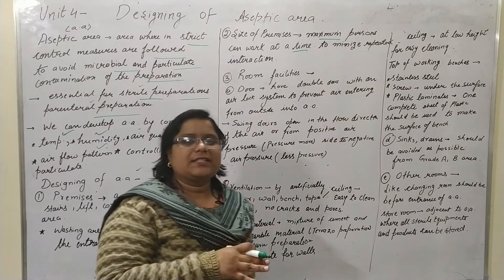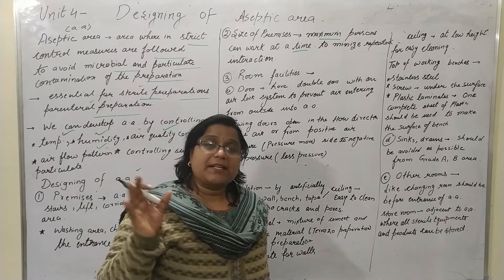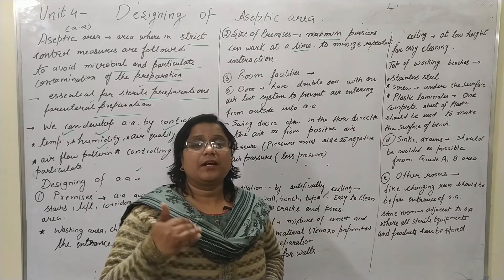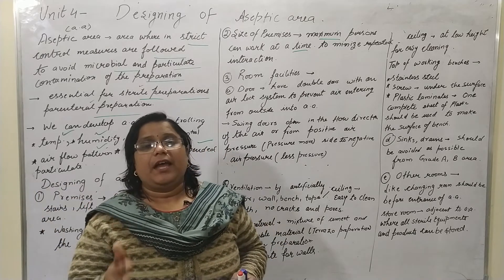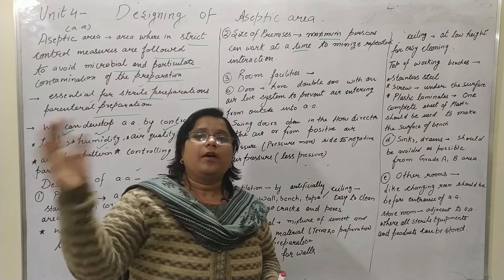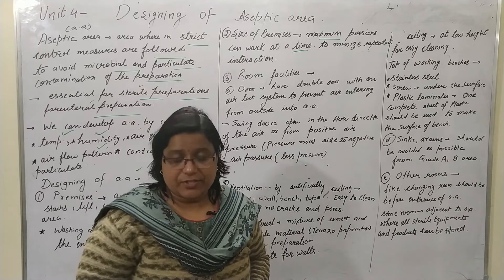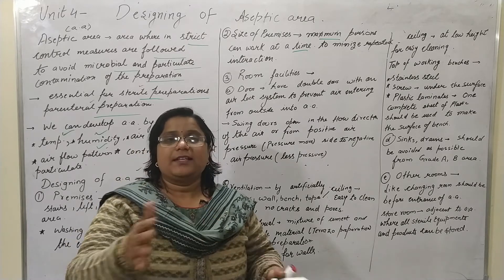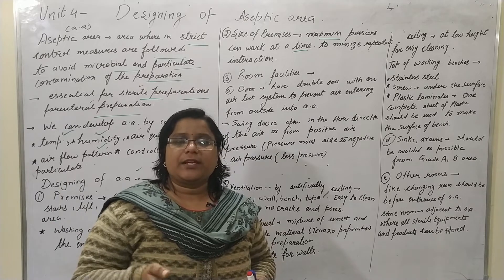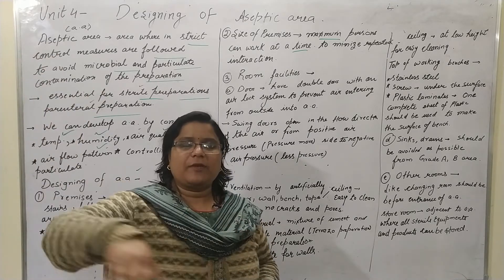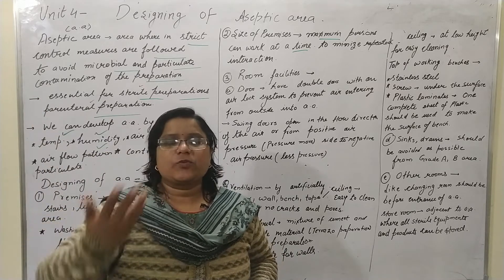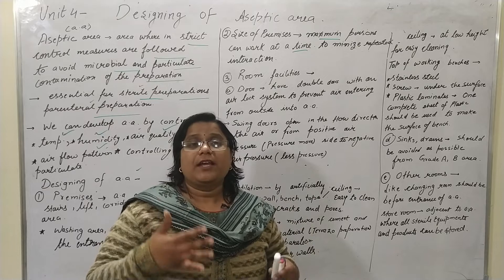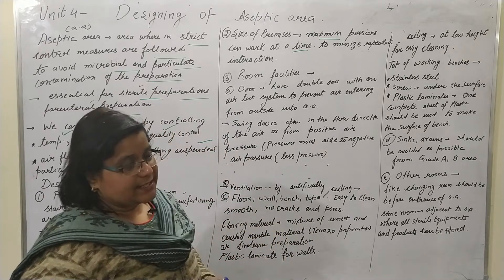The size of the premises should be such that maximum persons can work at one time. This is to minimize interactions: if the aseptic area is small and 10 persons come in at once and then exit, followed by another 5, multiple interactions occur. To minimize such interactions, the aseptic area should be large enough to accommodate the maximum number of persons at one time.